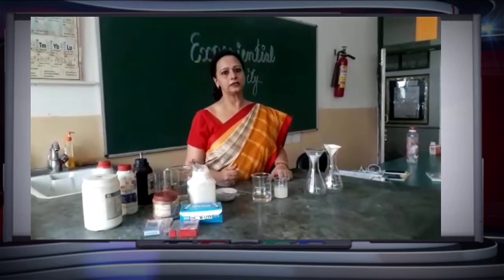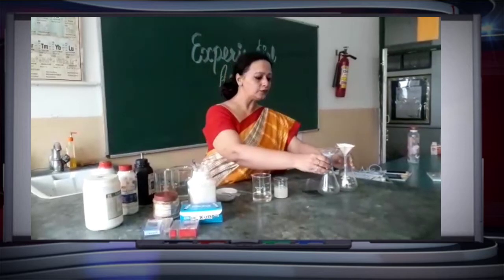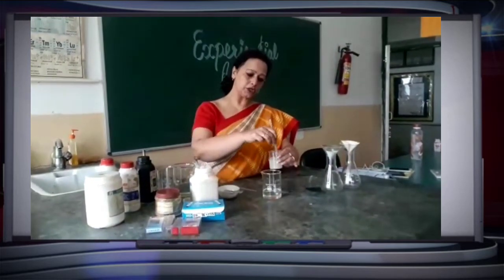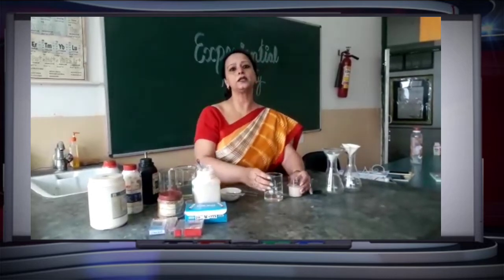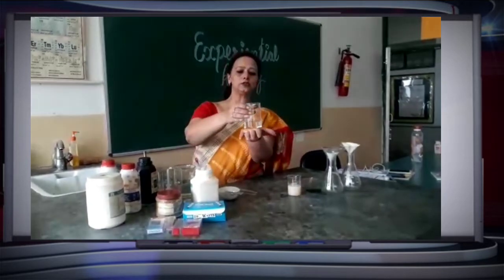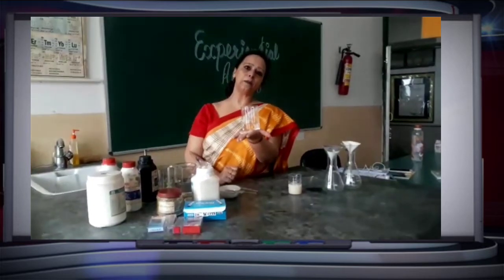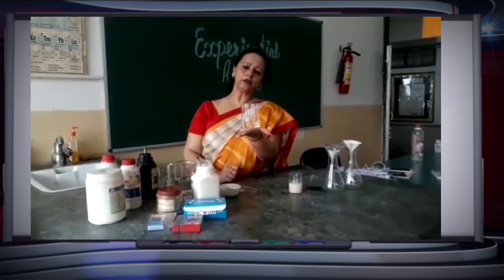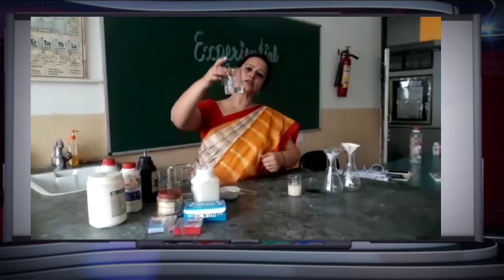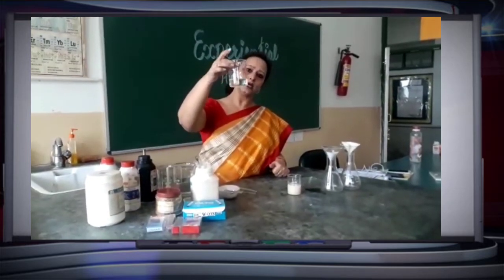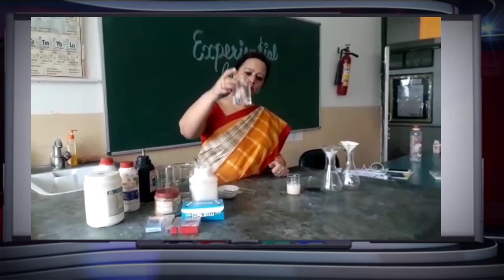Let us start with our first activity. First of all we are going to see whether these two solutions — suspension and true solution — are transparent or not. This is a true solution which we have made by dissolving sodium chloride into water. You can see this is transparent. That is why we say true solution is a homogeneous mixture and it is always transparent — meaning we can see through it.